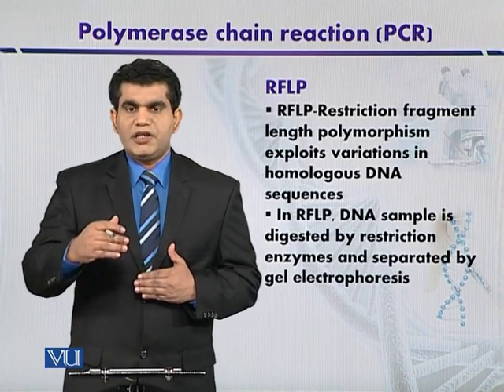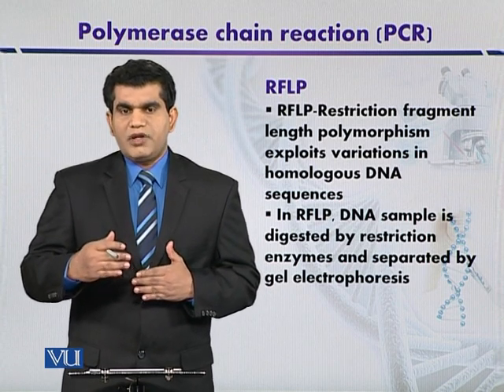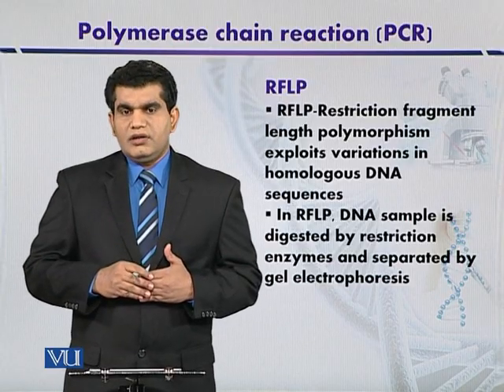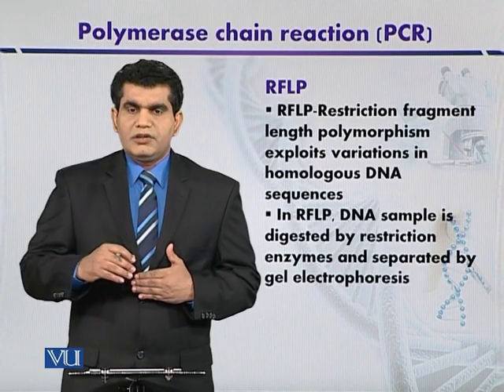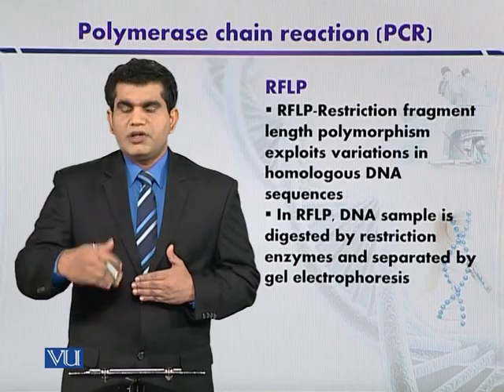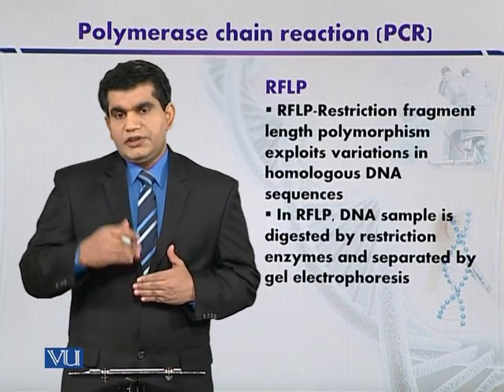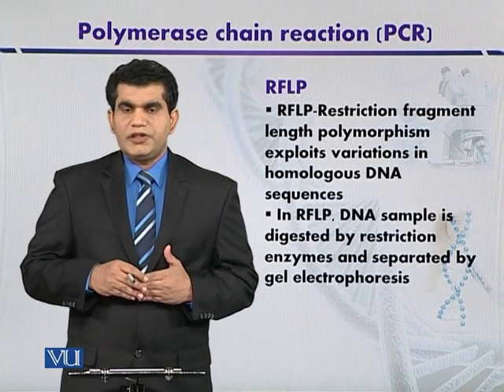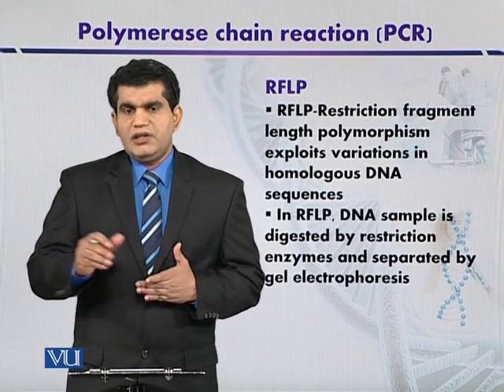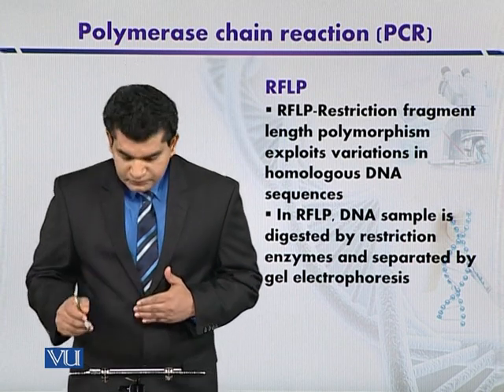This was based on DNA profiling or restriction fragment length polymorphism, the DNA pattern that is due to the variation in the DNA fragments, because the restriction sites may be located at different intervals, which will produce a different banding pattern. Now, how this technique can be used in forensic sciences, although we will discuss this application slightly later on, here I can introduce a brief outline.